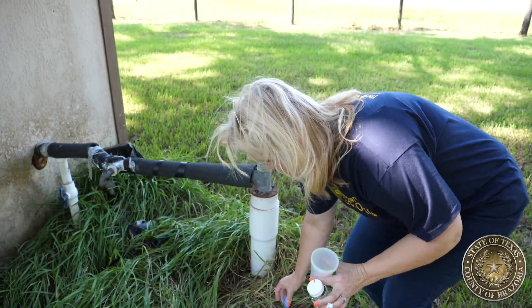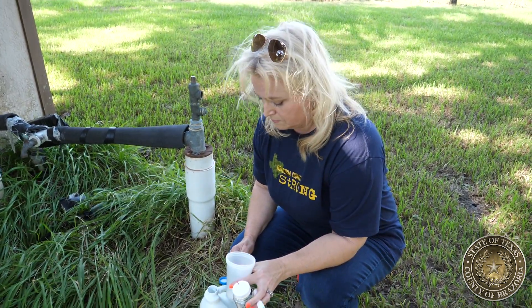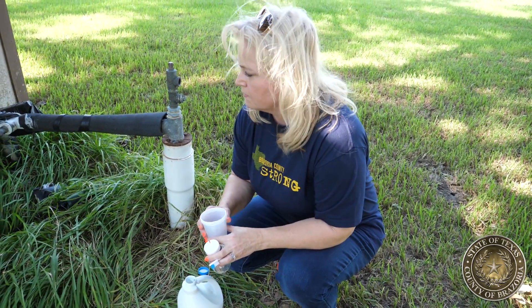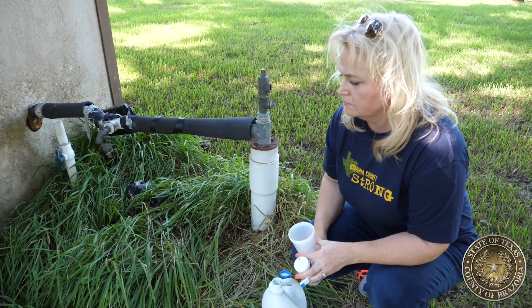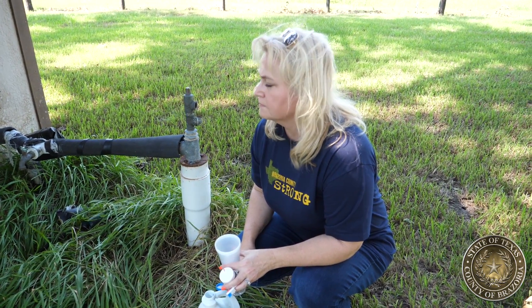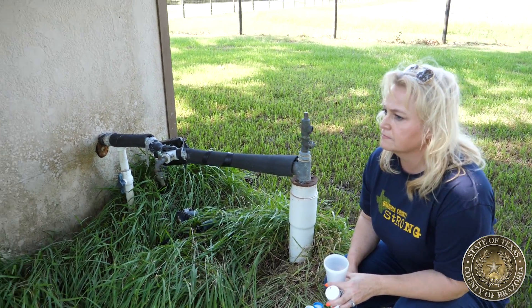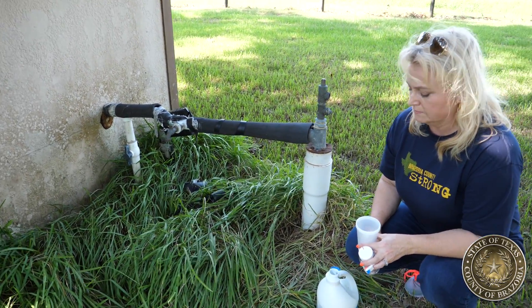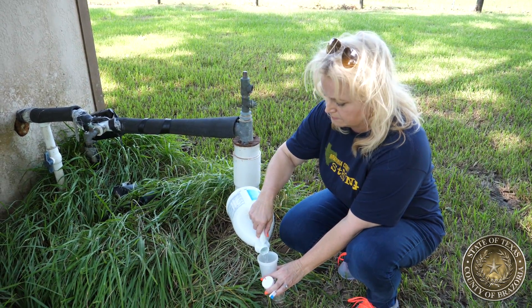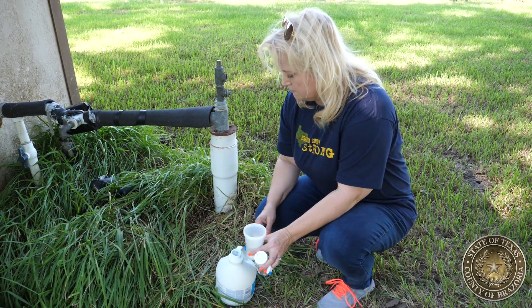Once you've collected the approved sample container, you'll find the proper location to collect the sample. We suggest an outside faucet as close to the well as you can get, and if there's a spigot on the well, that's even better. Avoid rubber hoses, dirty areas, or faucets that have nearby vegetation. Do not take samples from kitchens or bathroom sinks. Avoid sampling on windy or rainy days.